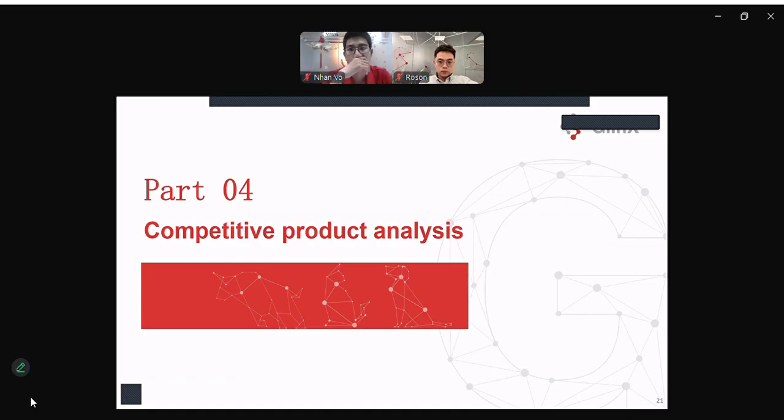The third reason is high reproducibility and standardization, because this kind of method can be fully automated and doesn't need a special technician to conduct the test. So it will not be influenced by the operators.